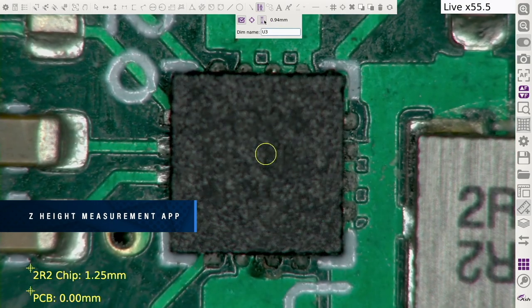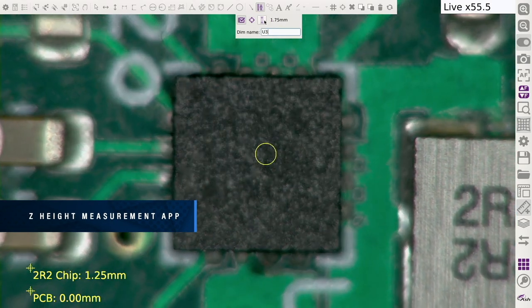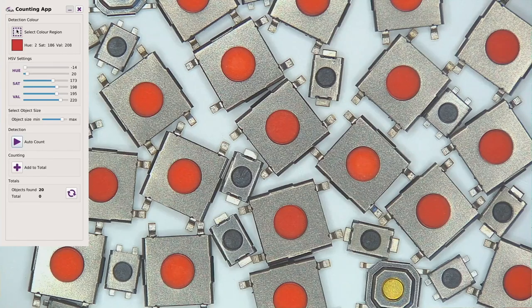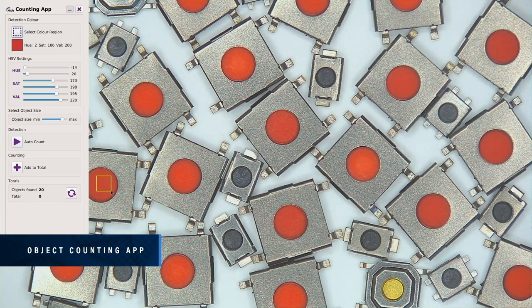Measure parts in the Z-axis in addition to the X and Y-axis. Rapidly inspect parts up to 5 times quicker when compared to outdated manual inspection methods. Automatically identify and count the number of objects displayed on screen in a matter of seconds, increasing efficiency whilst completely eliminating human error.